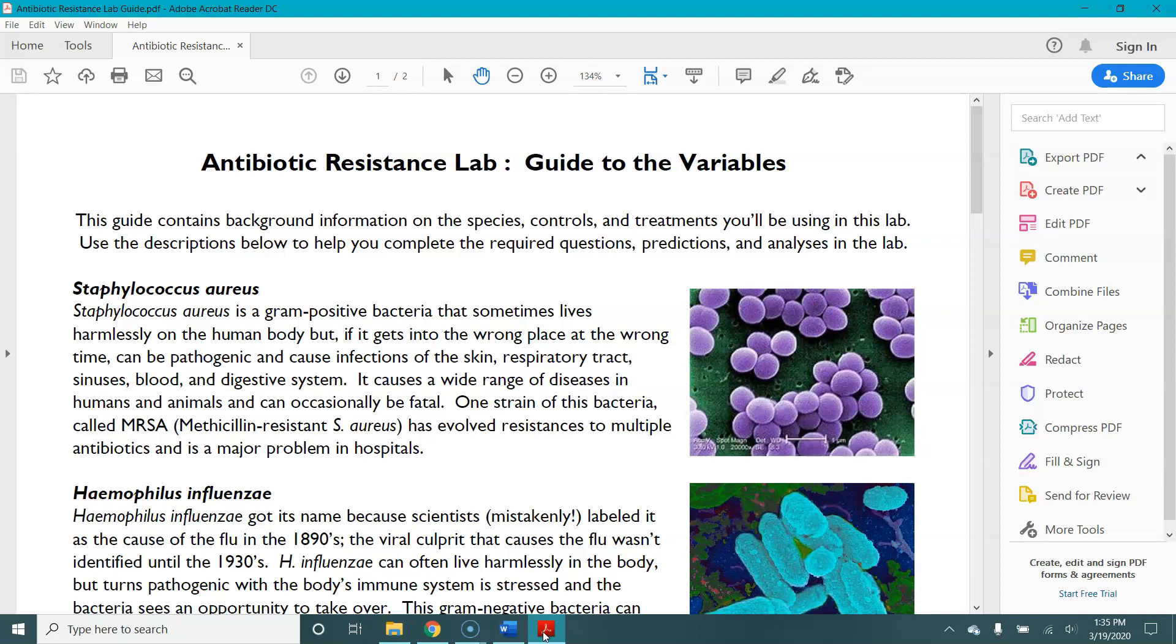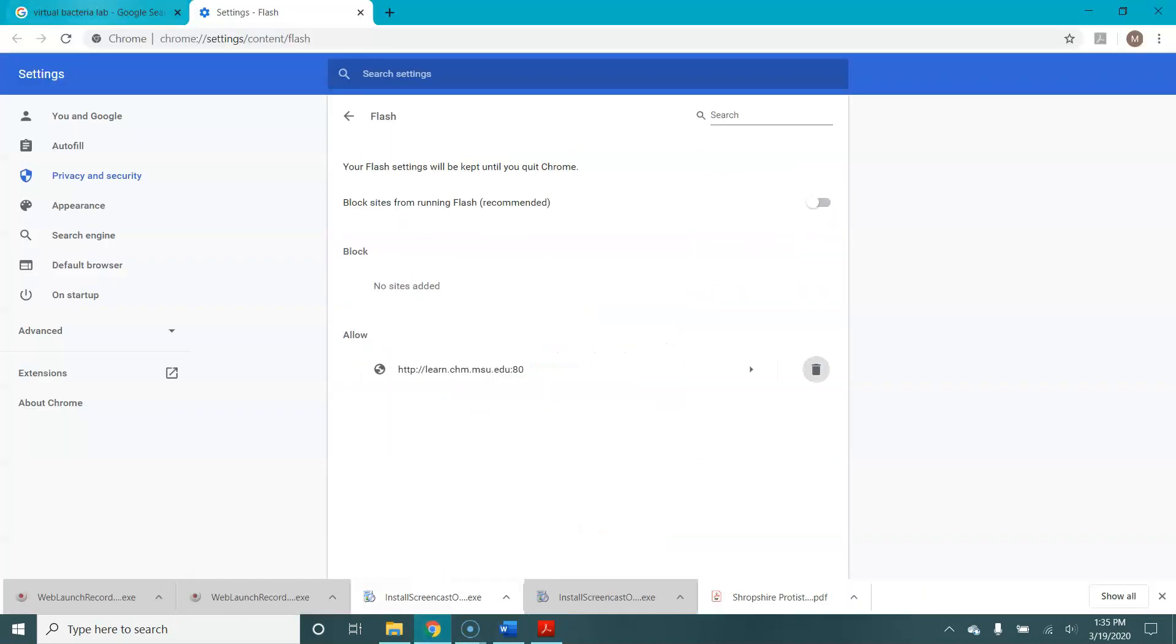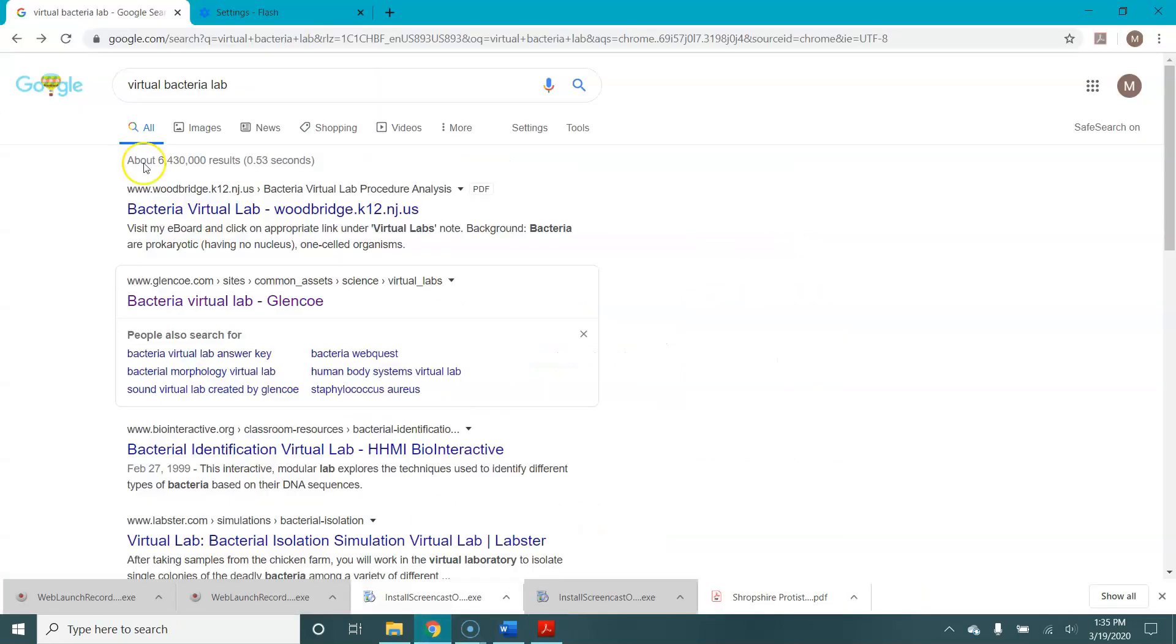Now you'll be working from a link on Verge or in a Google Doc. I don't have that link set up yet so I'm going to just take you to the link directly, same link that you would use.